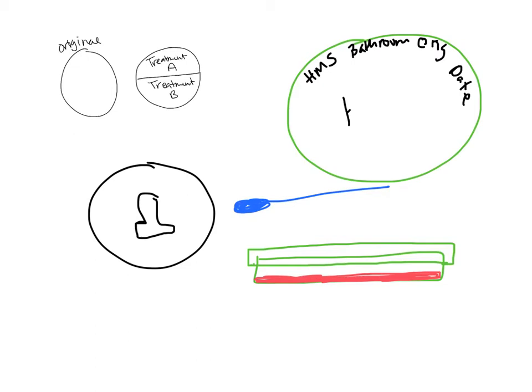You don't want to label in the middle, because when you're trying to look through the plate at the colonies growing on there, if those are bacterial colonies, you're not going to be able to see anything because you've written all over the bottom. And like I said, you also do not want to label on the lid. You want to label on the bottom, the side where the agar is, because the lid comes off and you can mix them up. If you label on the bottom, that doesn't happen.